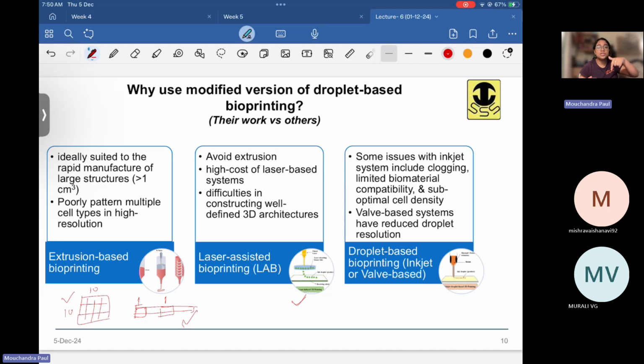The laser falls on the absorbing layer so that the absorbing layer extracts the excess energy of the laser pulse, and wherever the laser is moving over the absorbing layer, the bottommost droplet layer also experiences that pressure. Okay, and that pressure pulse is enough for ejection of a droplet. In this way it happens, but we will discuss in more detail next week.